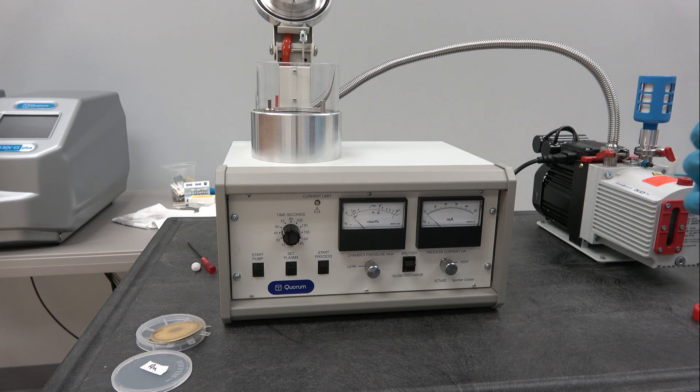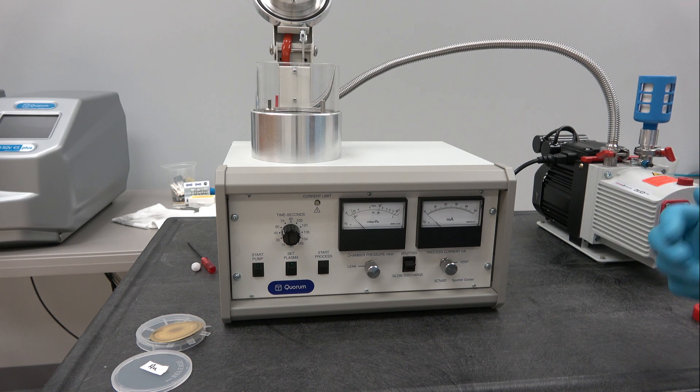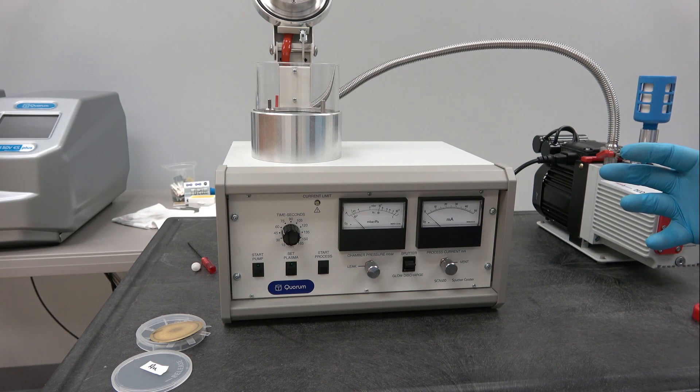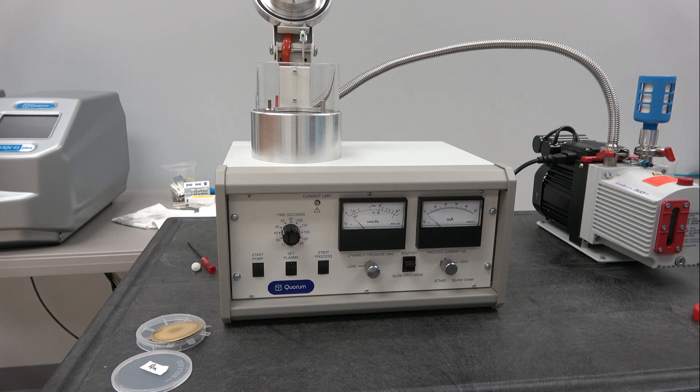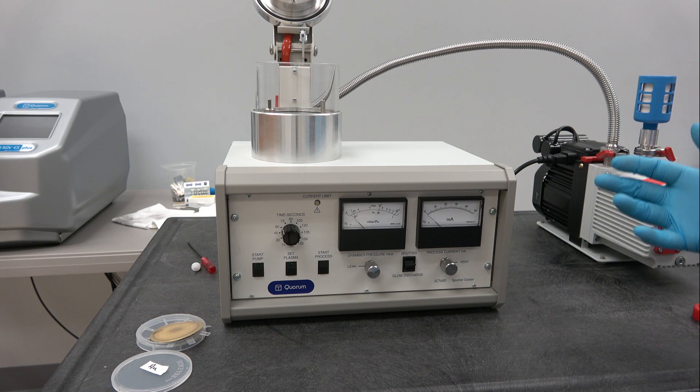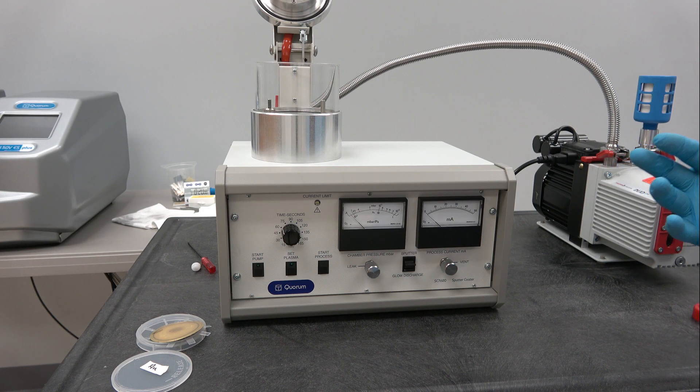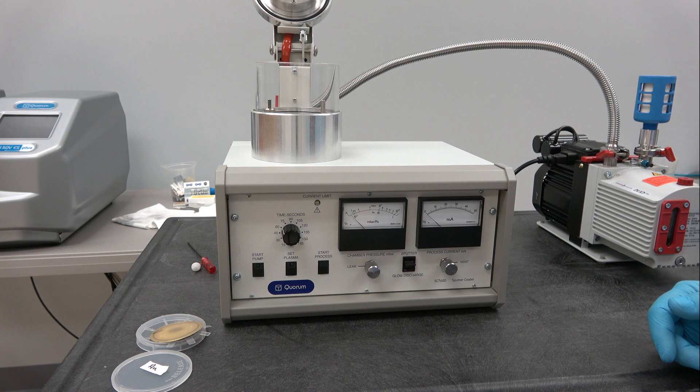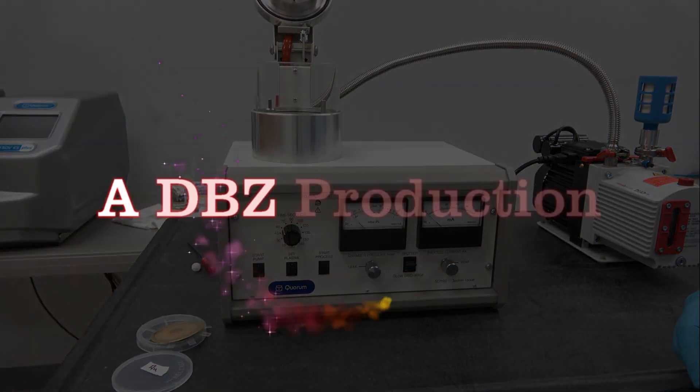And go observe them in the SEM. So this is the 7620 sputter coater, mini sputter coater. These are the basic operation and setup principles involved with this instrument. If you have any questions, feel free to contact me at Electron Microscopy Sciences and I can answer those questions for you. Thanks very much for your attention.